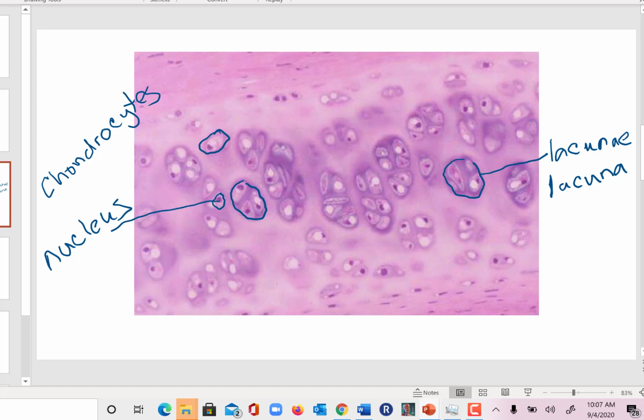So although you do not see the wavy collagen fibers like you did in the previous slide, I assure you those collagen fibers are there. The function of hyaline cartilage is to provide support, flexibility, and resilience. Hyaline cartilage is surrounded by perichondrium. If the hyaline cartilage is stained with a certain stain and then examined under the microscope, the tissue resembles carbonated grape soda, or as my students like to say, raisins stuck in pink stained glass.